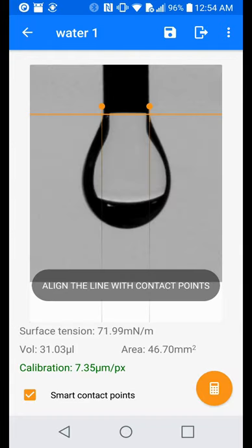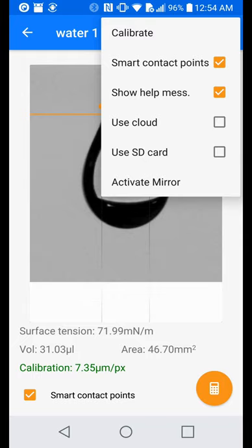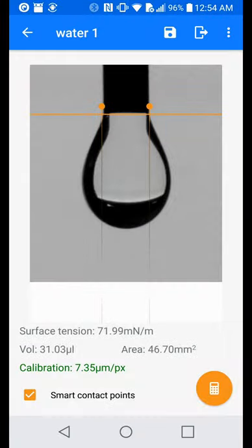The calculated data can be saved in either the SD card or the cloud service of your choice. Simply select either the cloud service or SD card, and hit the save button.